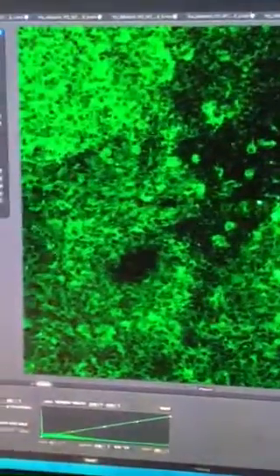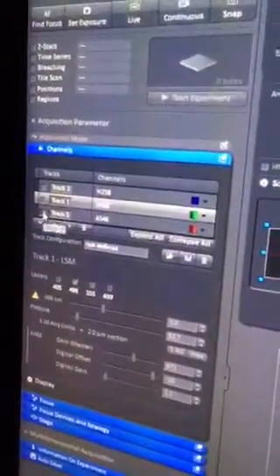And it's pretty cool. We can go here again, and the last one I have is a 546. So what this one did is it's going to be telling us where all the dead cells were. So now when I click live, you can see it's only one dead cell here, maybe a small one right there, right here, and we can adjust the tuning to try and get the maximal amount.